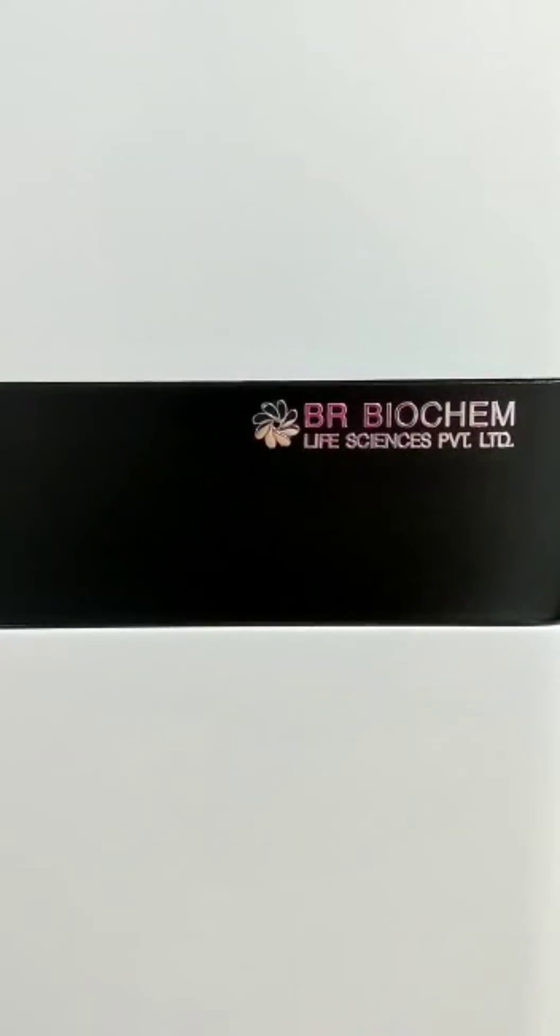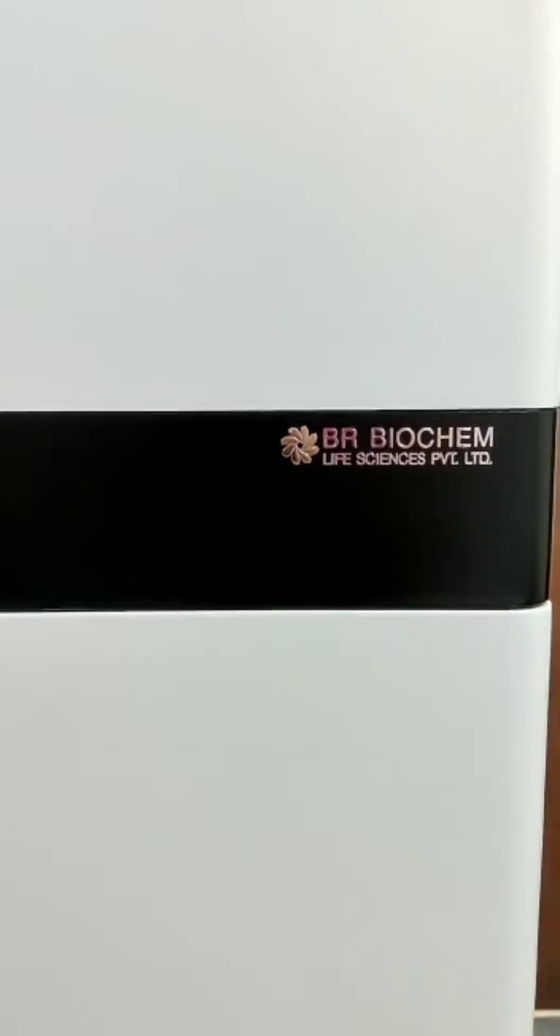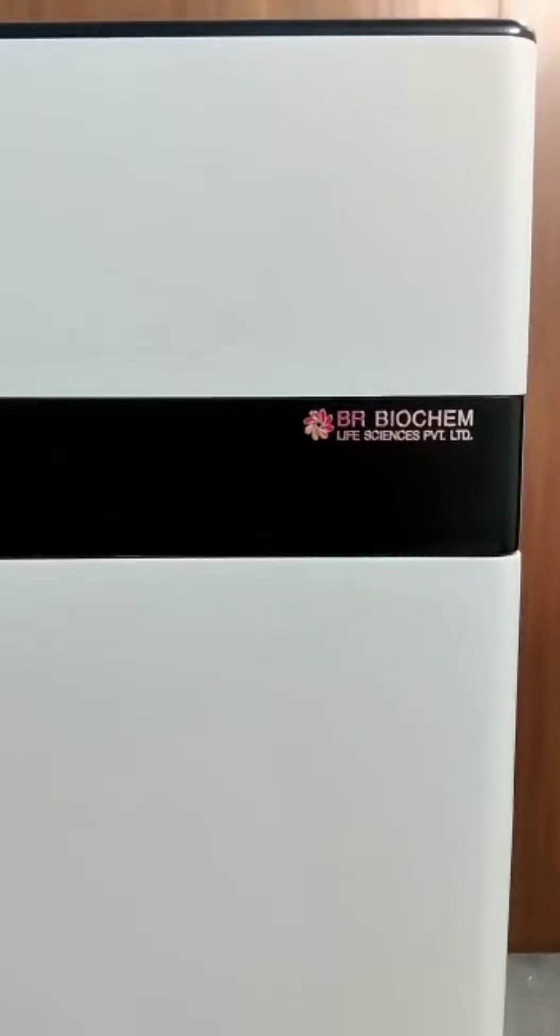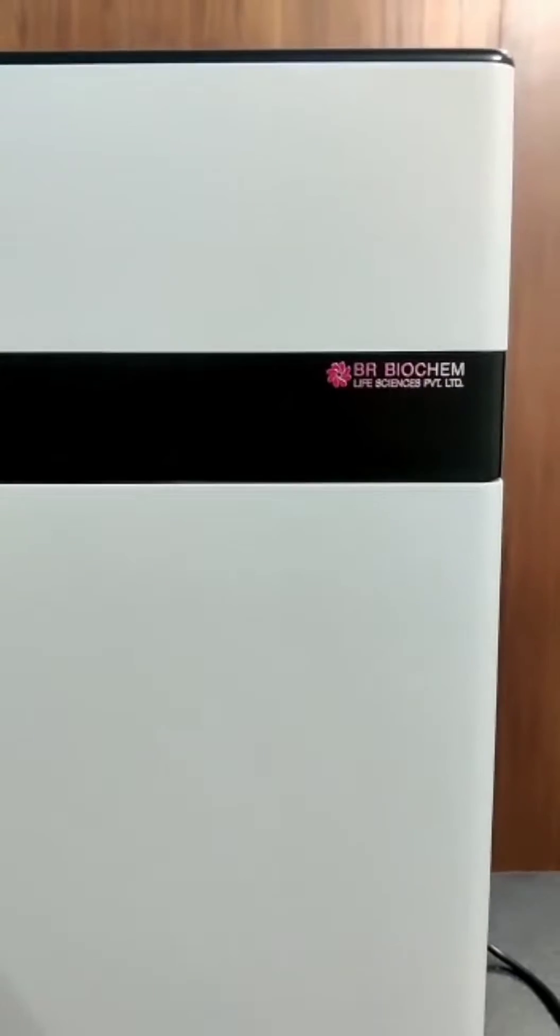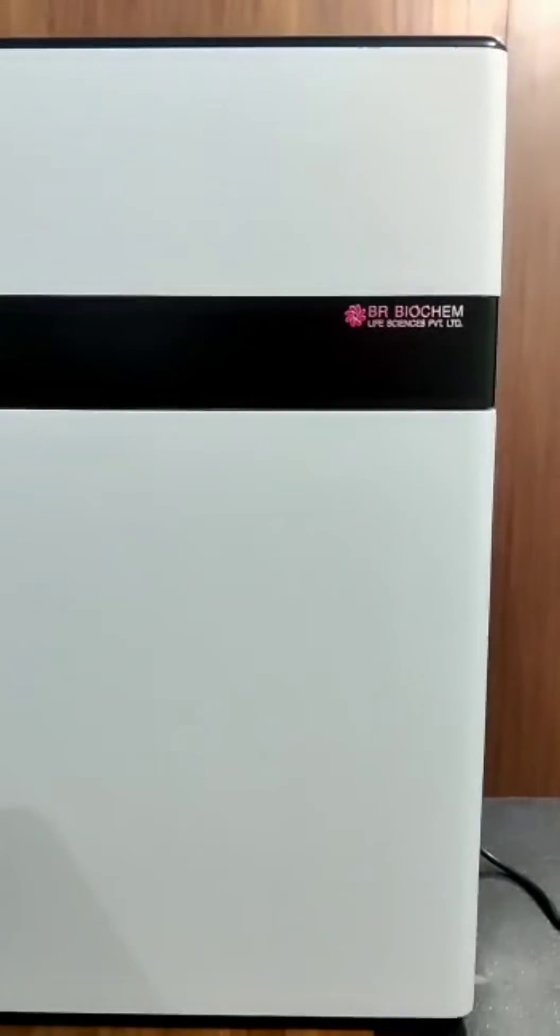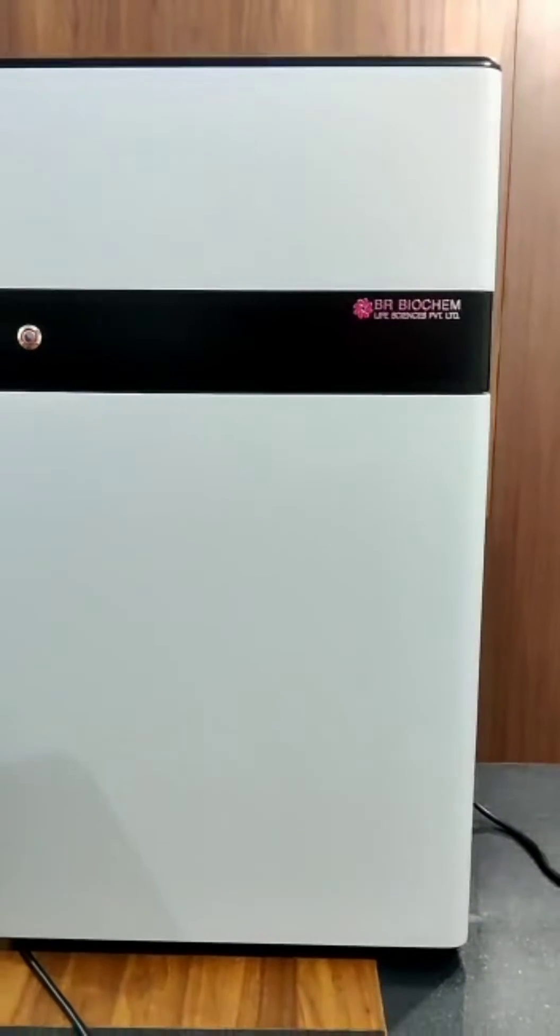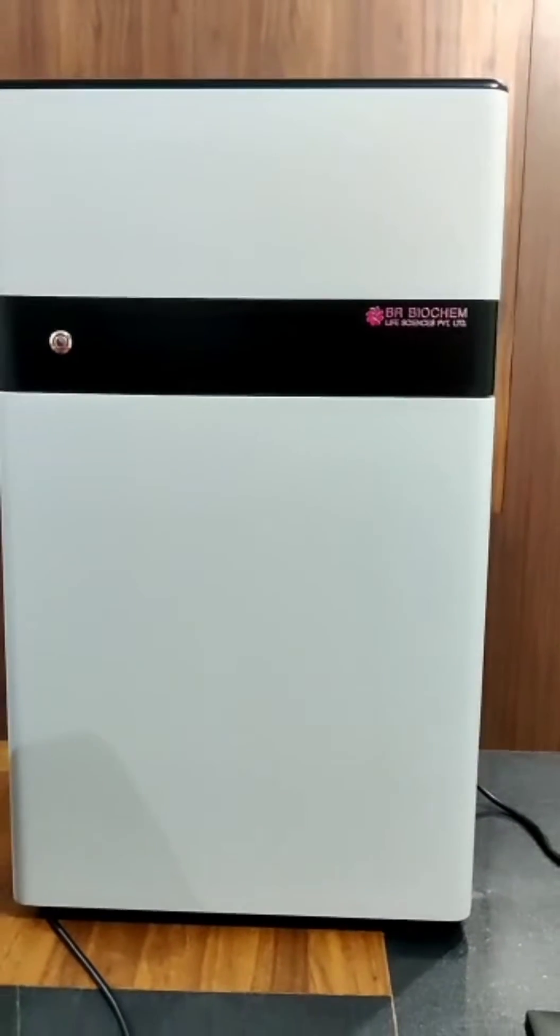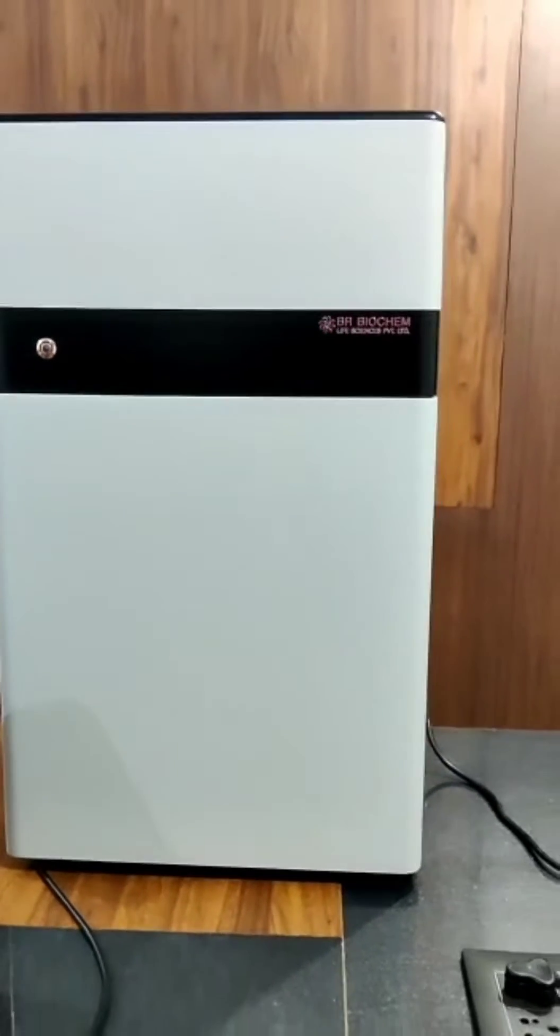Hello everyone, welcome to BR Biochem Life Sciences Pvt Ltd. Today we discuss the GEL Documentation System.